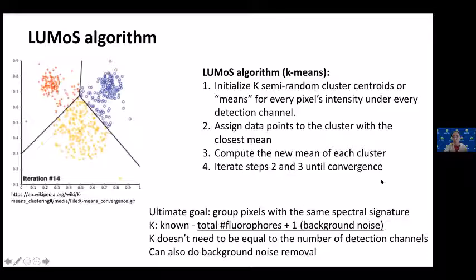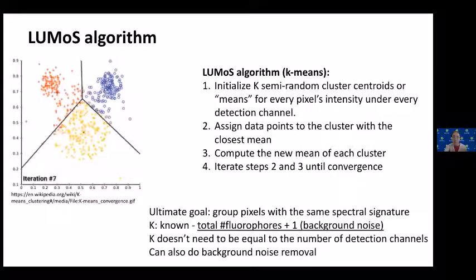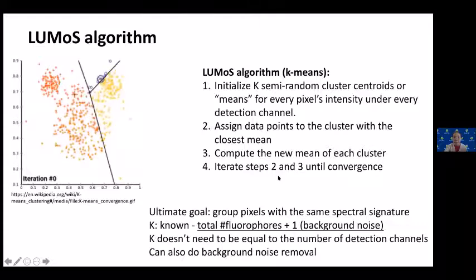And because we have an additional cluster, which is our background noise, another side benefit of the Lumos algorithm is that we can also do background noise removal with Lumos. So a lot of biologists also like this.